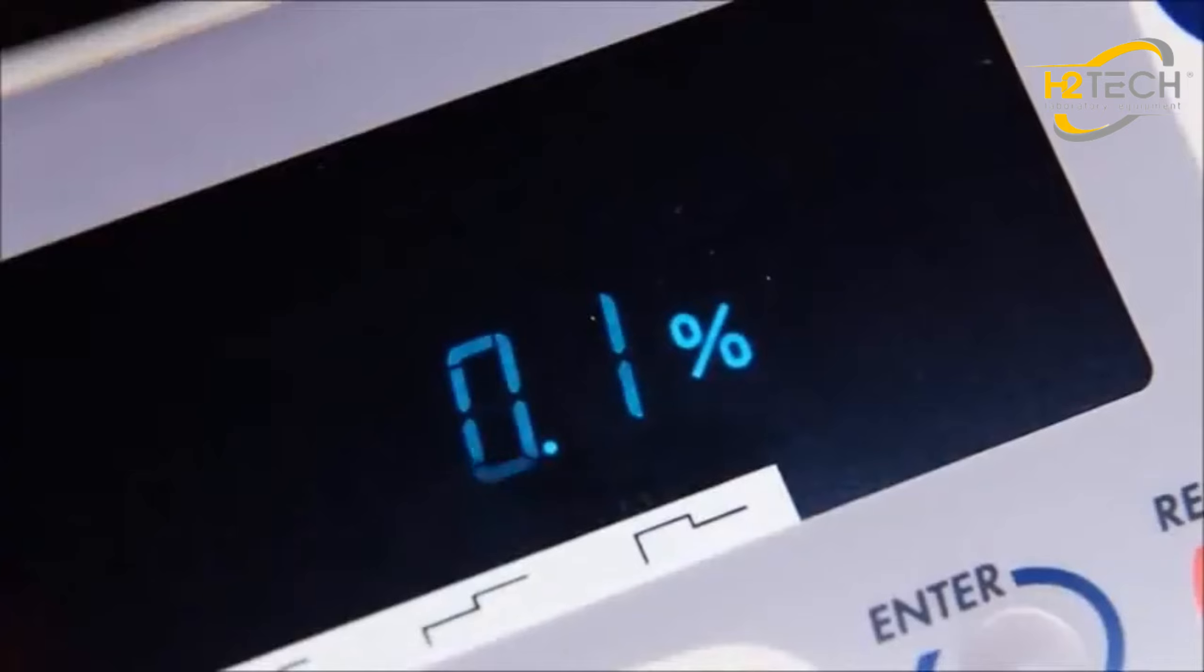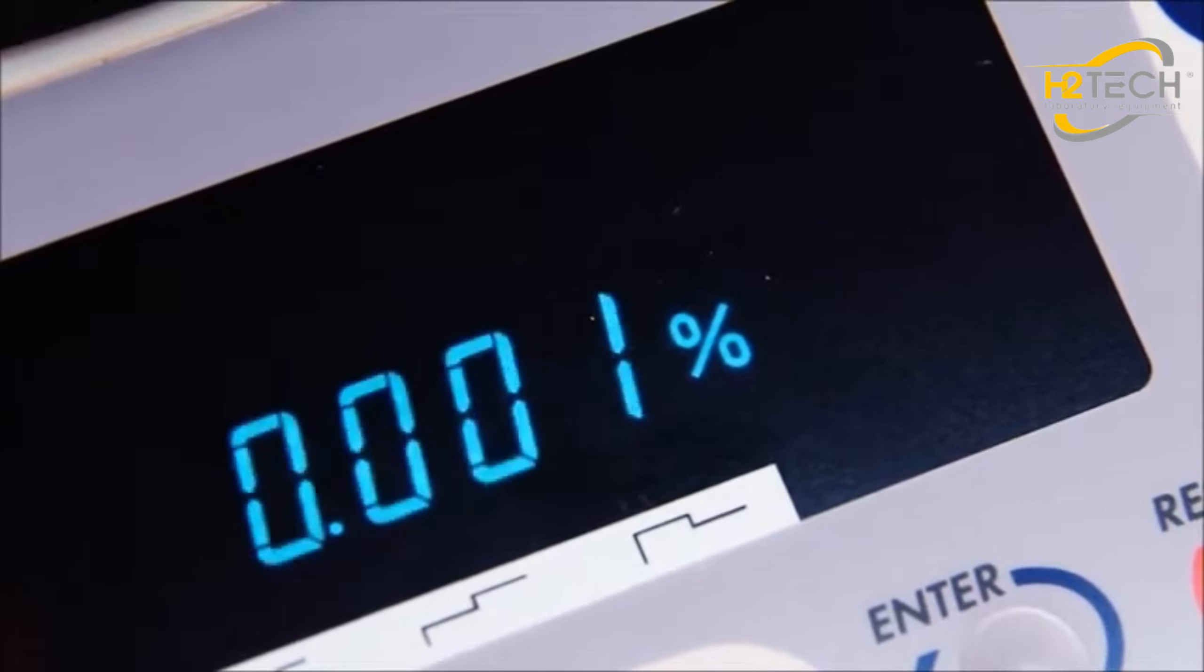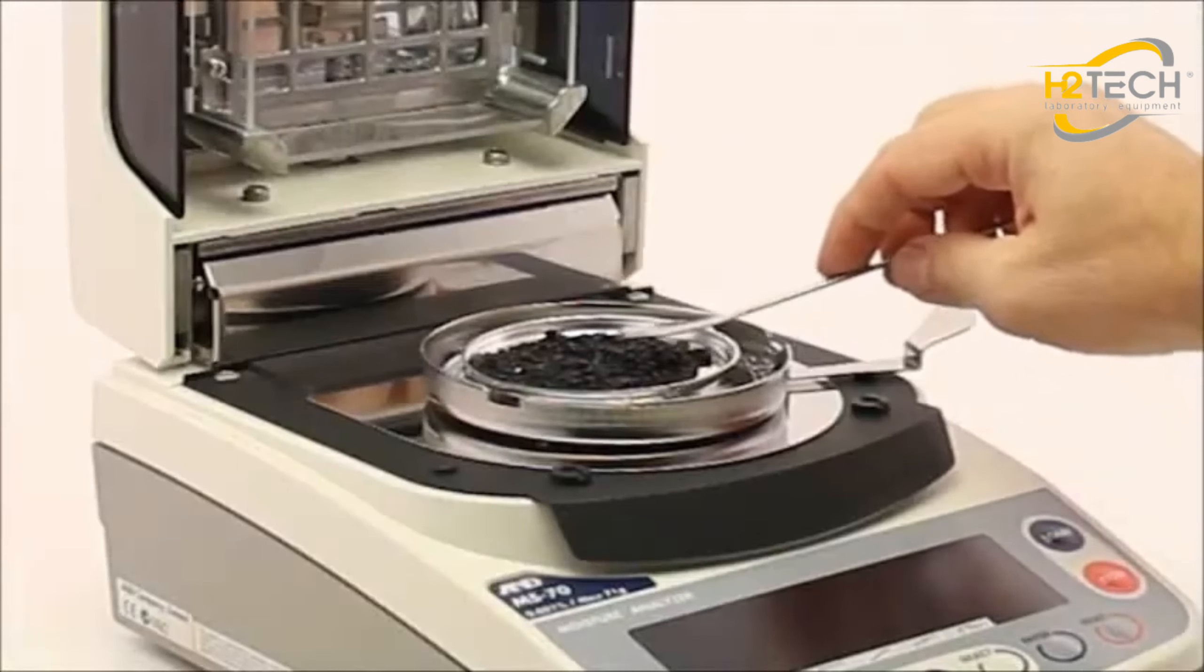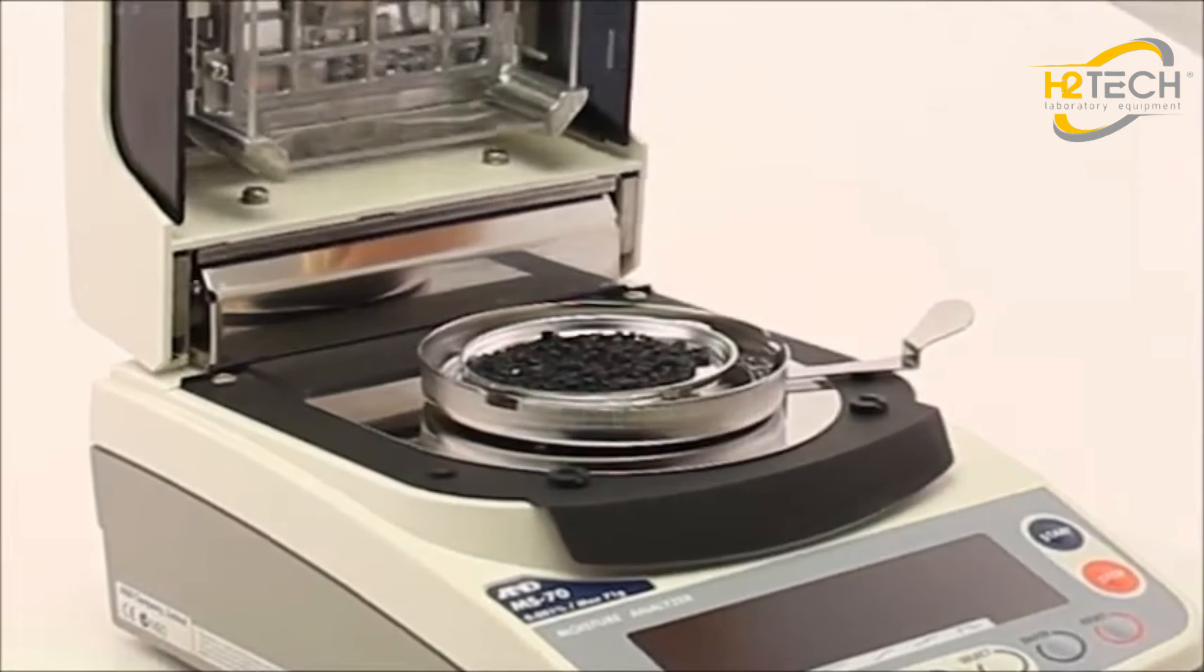The model MS-70 measures down to 0.001% moisture content with its resolution of 0.1 milligrams. Now even challenging low moisture substances like plastic resins can be conveniently characterized.